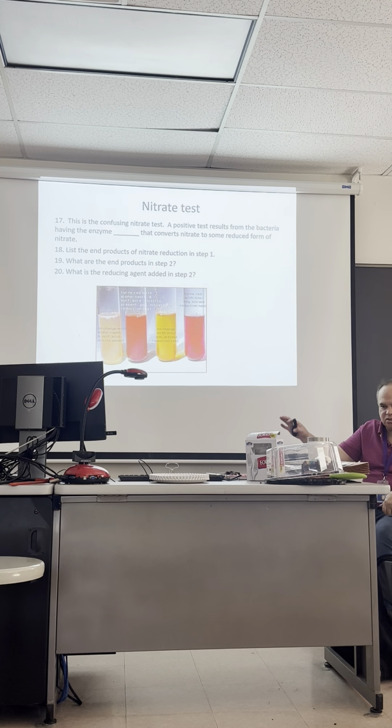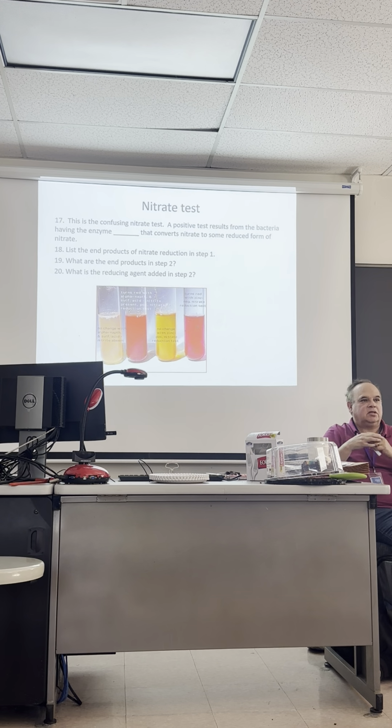This is a nitrate test. Just listen to me because I'm going to make it more fun than this. So in the nitrate test, after you inoculate the organism, you come back in 24 hours, and in step 1, you add 2 reagents. Which reagents do you add for step 1 of the nitrate test? Sulfanilic acid, and naphthylamine, don't say naphthol, naphthylamine. If you get a red color, what does that indicate? Positive for nitrate being reduced to nitrite, nitrite present.